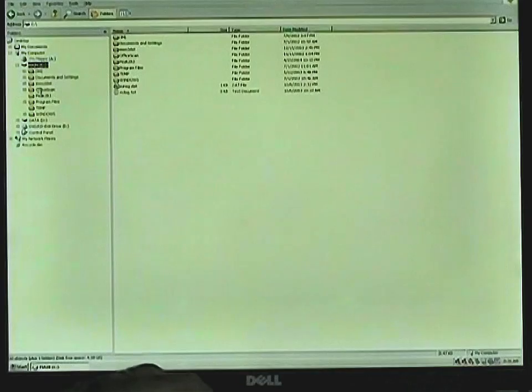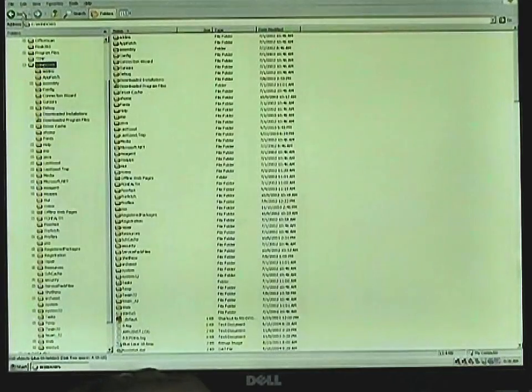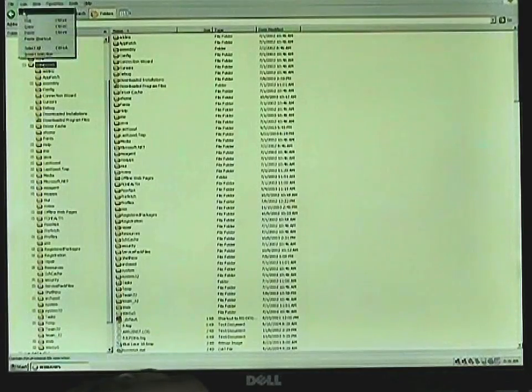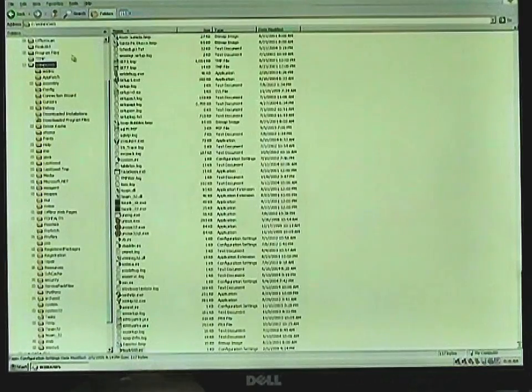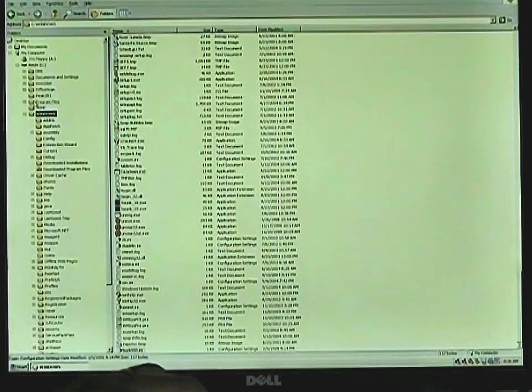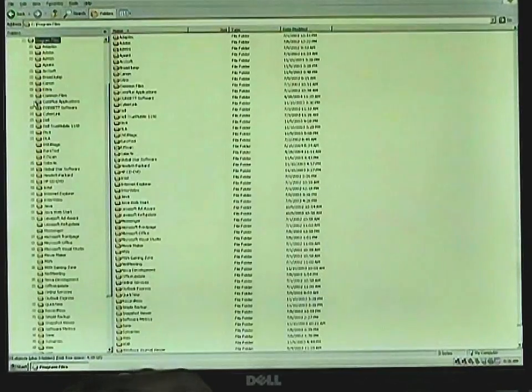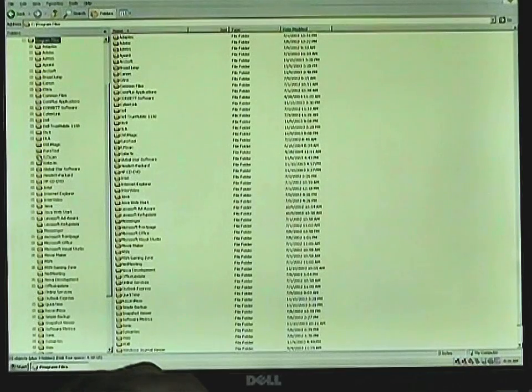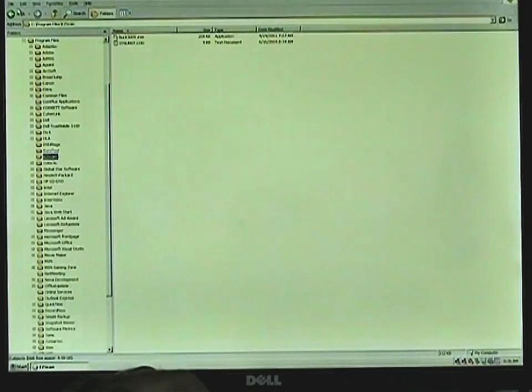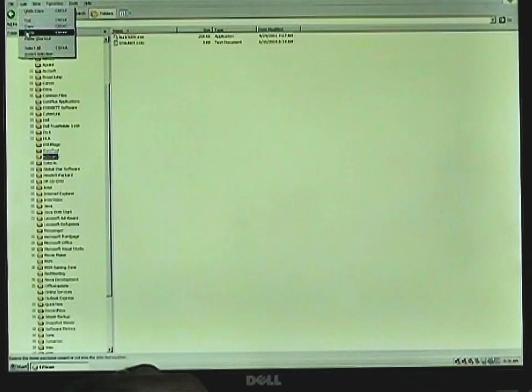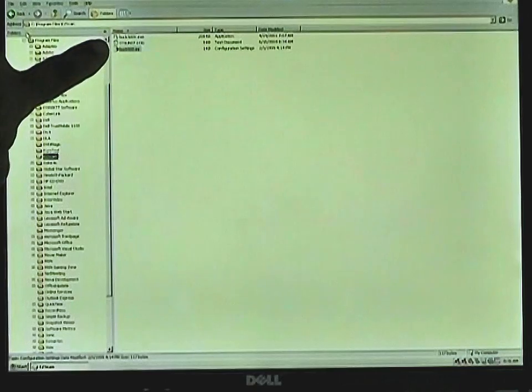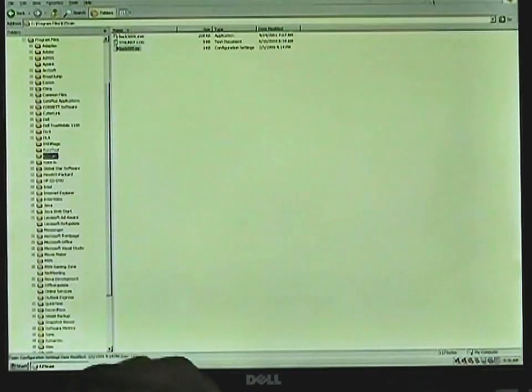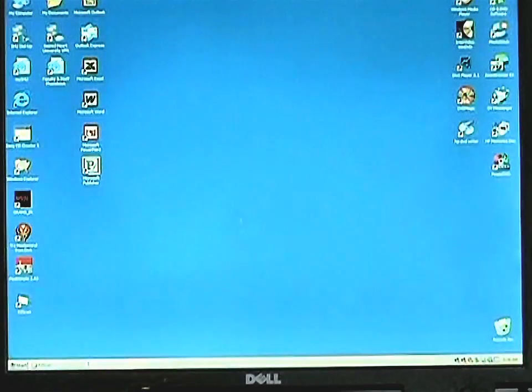Enter your Windows directory and also to the Easy Scan directory under the program files window. This will ensure proper communication between the M500 and the PC for operation and control.